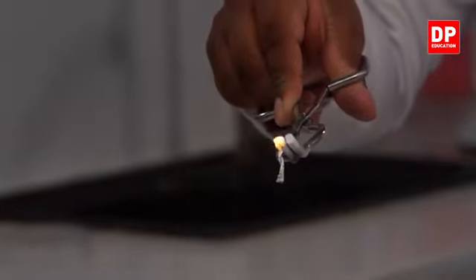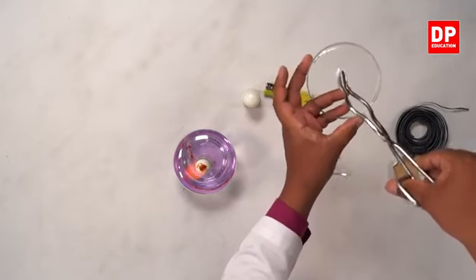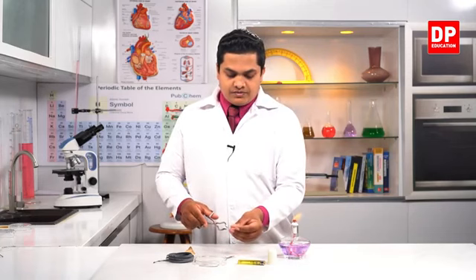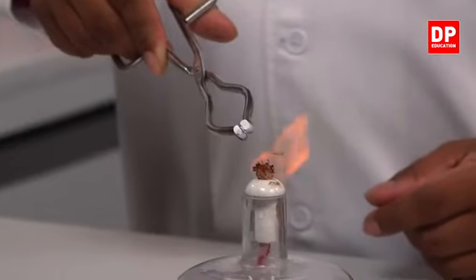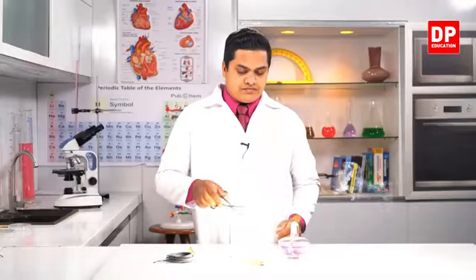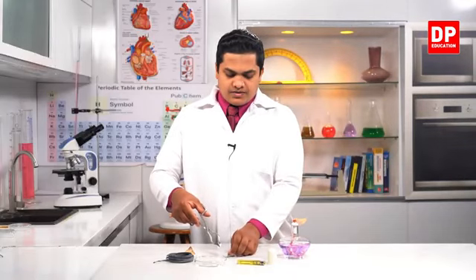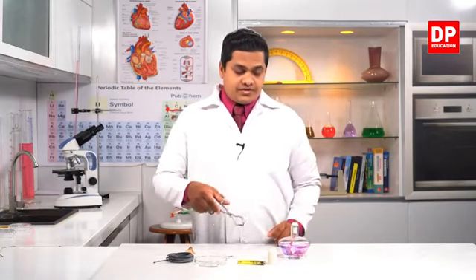Right, my dear children, observe. So I'll use this petri dish to put the waste. I'll use another one. I'll use another piece and I'll burn it. See the color? Let's try another one and let's see what our residues are.